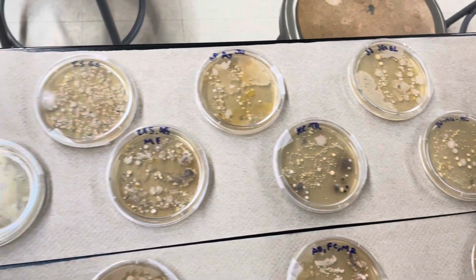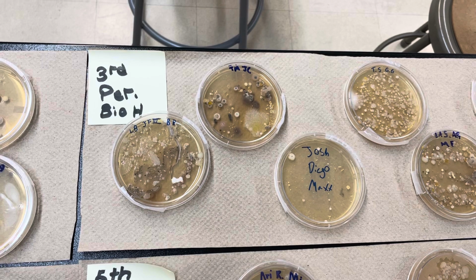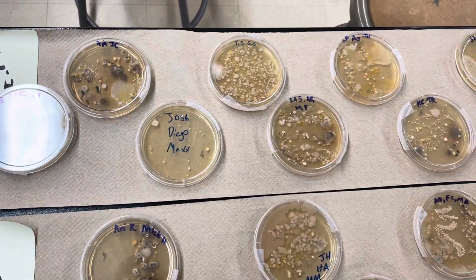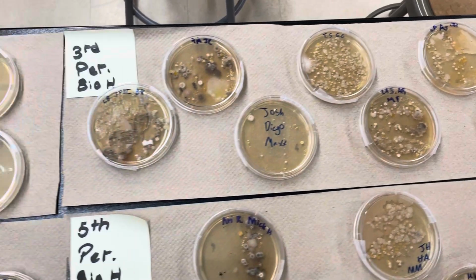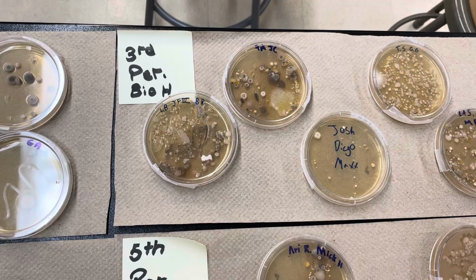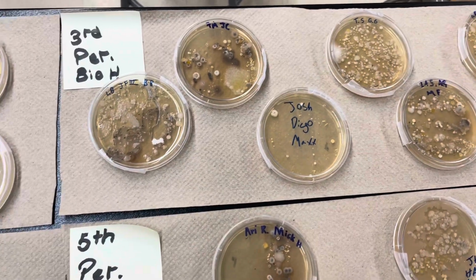In fact, what most of the guys told me is that they simply just swabbed the tops of their lockers, which are dusty and dirty and grimy, so they haven't been cleaned for a while. I know there's a couple of groups that told me they swabbed the lunch tables. Kind of the same thing. There's food, there's crumbs, leftovers, things of that nature. So this agar that the stuff is growing in, that's just the food. So that allows these colonies to grow and reproduce and allow us to see them, basically.